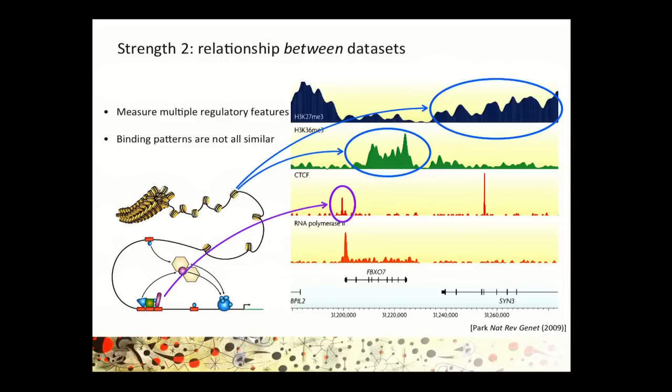We've also got transcription factors, in this case CTCF, and you can see here you get the traditional nice narrow peak of binding in contrast. And then we can also find in this plot polymerase binding, which shows the amount of transcription that might be going on in a particular gene. So what we emphasize here is that you don't necessarily have to just show binding, but also exposure to nuclease, cleavage, etc.